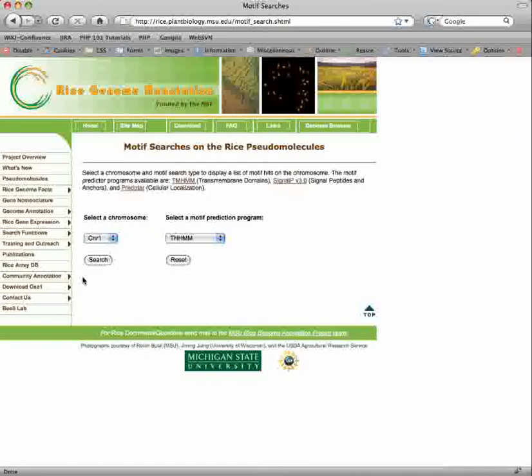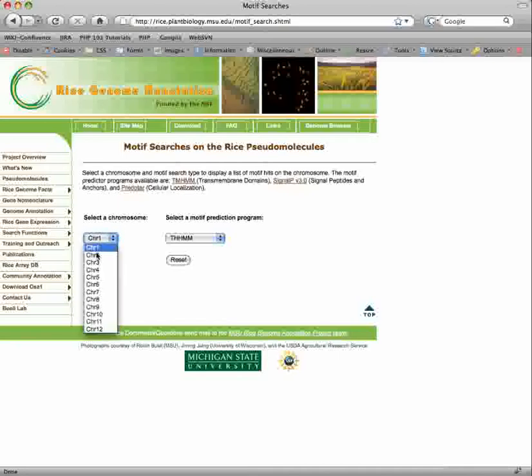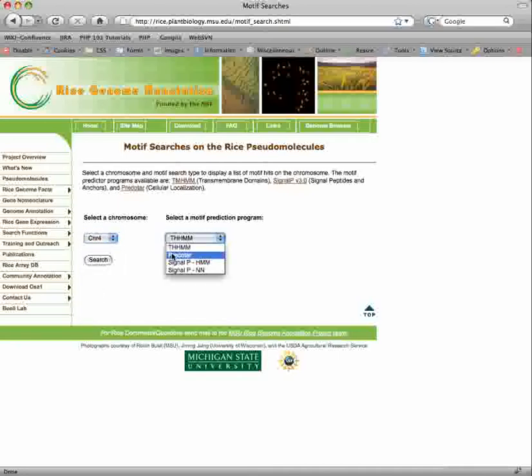You can search our annotation for motifs predicted by TMHMM, SignalP, and Predotar. Select the chromosome and motif prediction program to get the output.